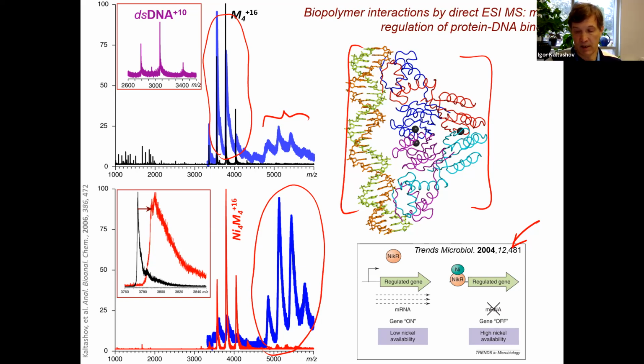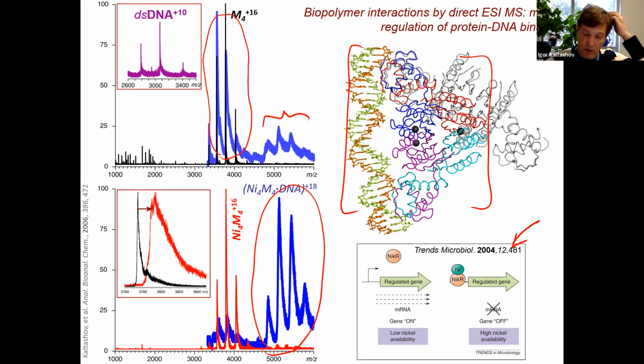And the reason for this binding is something that is not obvious from the X-ray structure, but there is some residual binding even for this protein conformation. It's much weaker because instead of bidentate binding, you have monodentate binding now. But nonetheless, you can clearly detect that with mass spec. So this is a really wonderful technique in that regard.